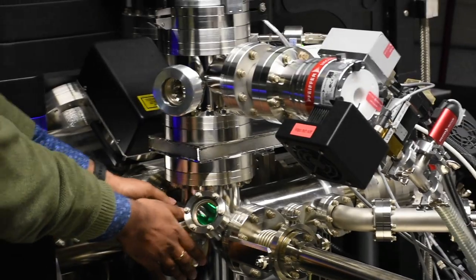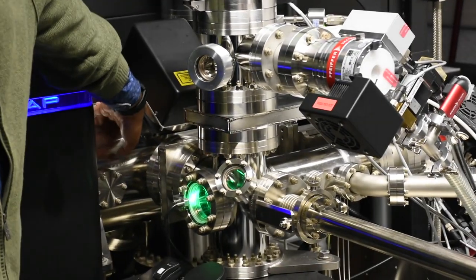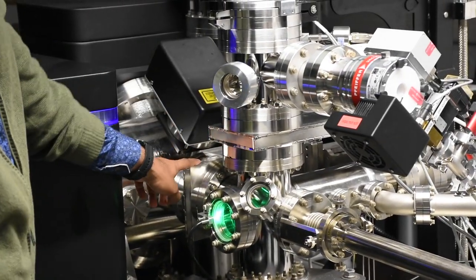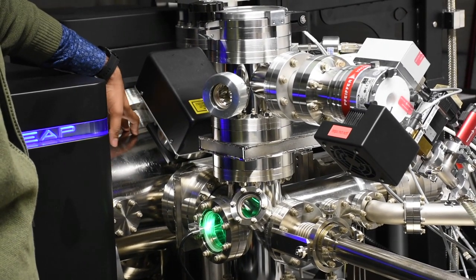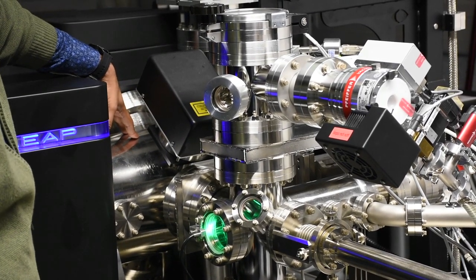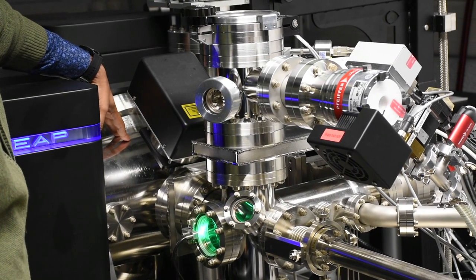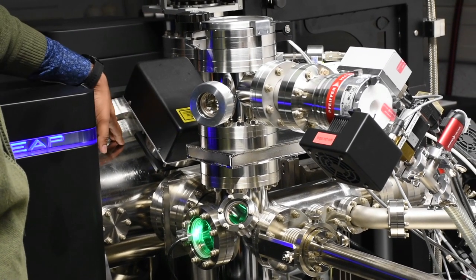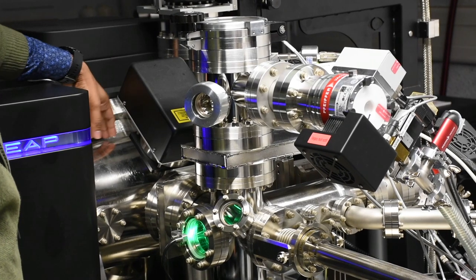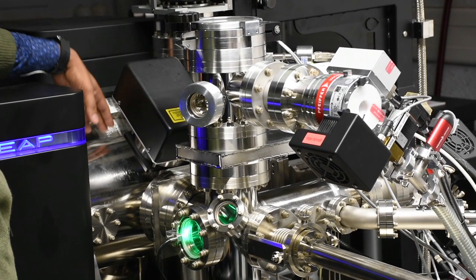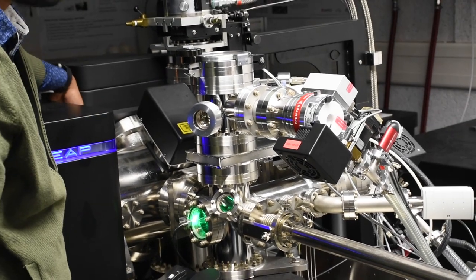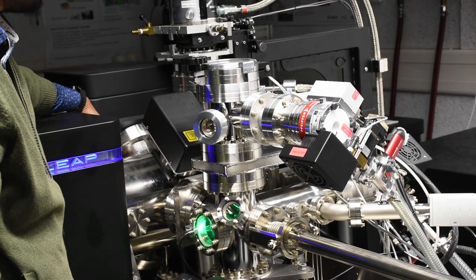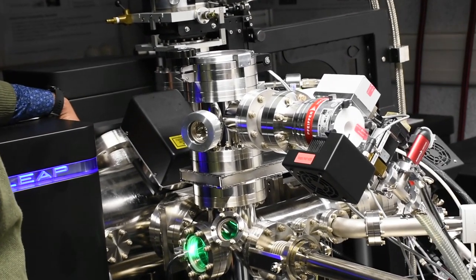Now the buffer chamber is separated from the analysis chamber, which is here, by this particular valve. The analysis chamber itself is at a pressure of 10^-11 torr and is pumped by an ion pump. The analysis chamber is equipped with a voltage pulsing unit and a laser pulsing unit.